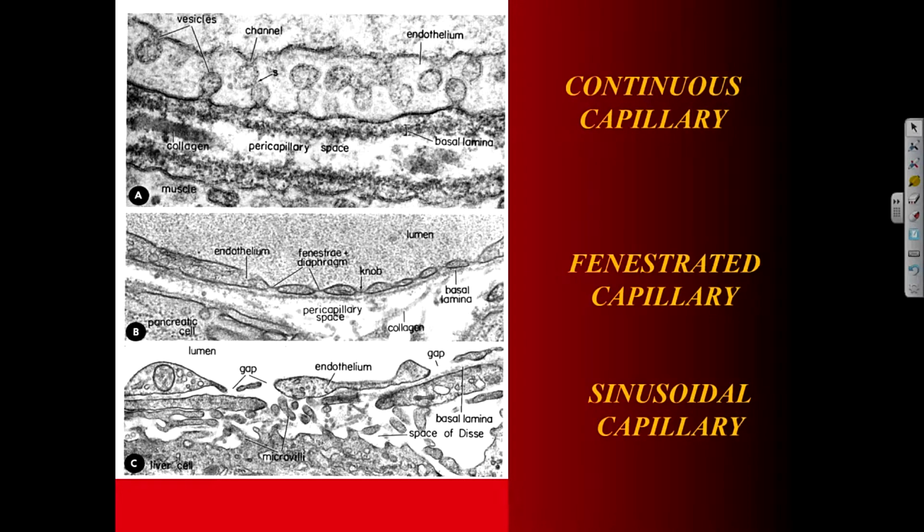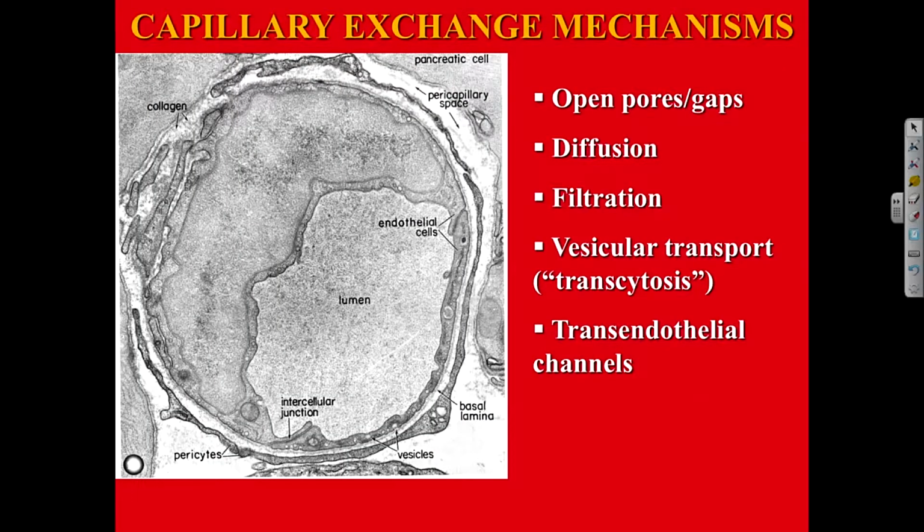Yes. Yeah, basically sinusoidal capillaries in the spleen. Okay, other questions? So moving right along, then here is a picture of another continuous capillary, the most common.